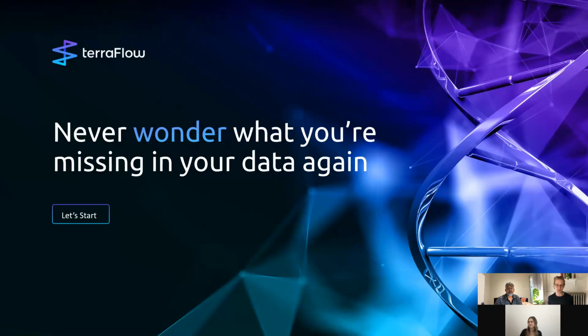And the way we handle those batch effects is we don't normalize your data. We don't actually manipulate your FCS files. Rather, what we do is we run the entire analysis independently within each batch. And then we combine them and look for disease associations that are consistent across the entire data set. So we're not manipulating your data, we're doing a statistical analysis to look for robust differences.